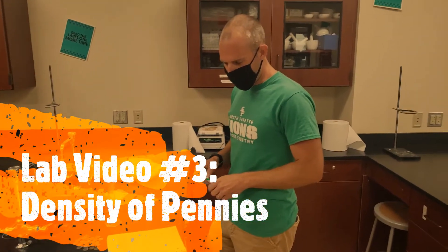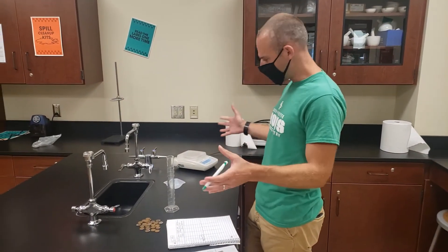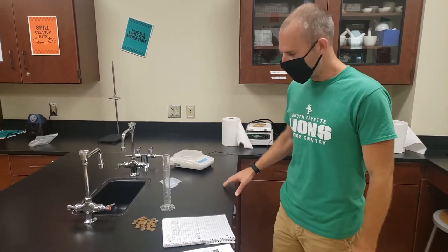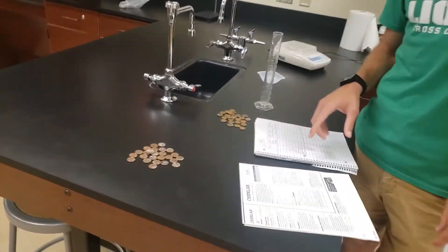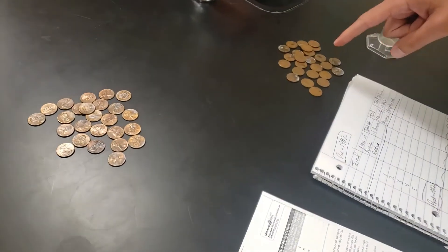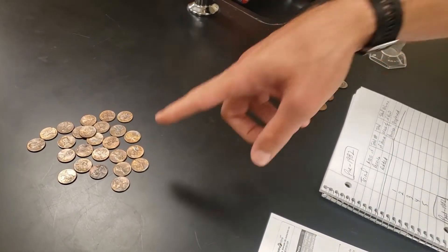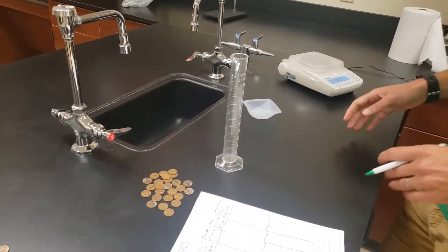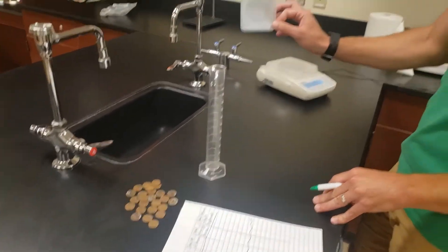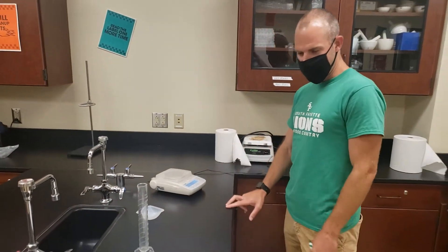We're going to perform the experiment. We're using density to date a coin. In terms of the materials I need, it's pretty slim. I need some pre and post-1982 pennies. We've already sorted those — pennies manufactured before 1982 and those that are post. We also have a 100 milliliter graduated cylinder. The procedure calls for a plastic cup; we're using plastic weigh boats that we'll then use on our digital balance.